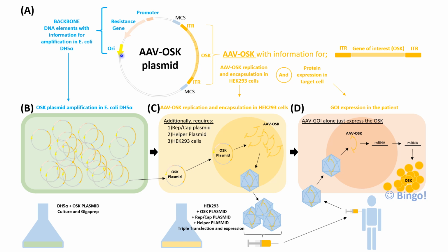What we have also here is a promoter and a resistance gene. The promoter is preceding the resistance gene. The promoter is necessary to express the resistance gene. The resistance gene is a gene that codes a protein that makes the bacteria resist an antibiotic. It may be ampicillin, tetracycline, kanamycin, or whatever.